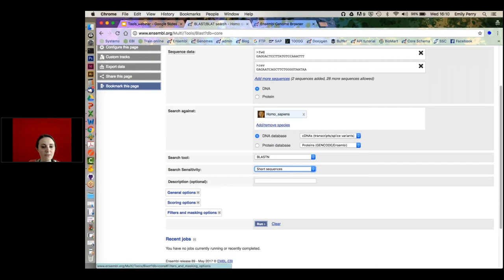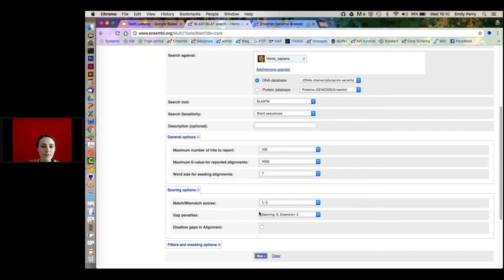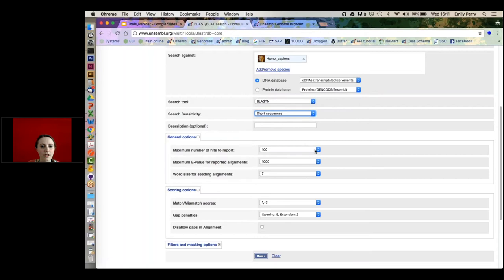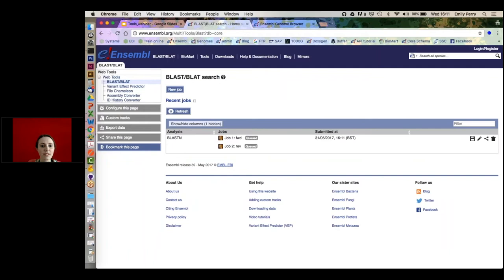If you open the scoring options, you can alter BLAST parameters if you're really into them. If you switch to 'Distant Homologies' you'll see the parameters change. It's worth fiddling with them to match your needs, but the short sequences setting should cover most use cases. Now I'll hit Run.